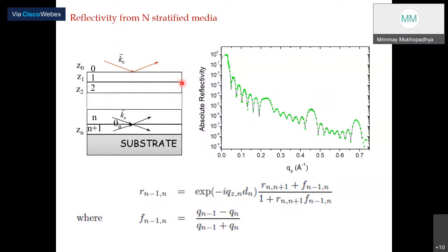It is a much more non-destructive and more precise measurement, where you are not destroying or disturbing your sample, but measuring all the information along the depth. What does that mean? It means you have a density variation along the depth, and you can extract each layer of density variation depending on your reflectivity profile, and then say this is my material information along the depth.